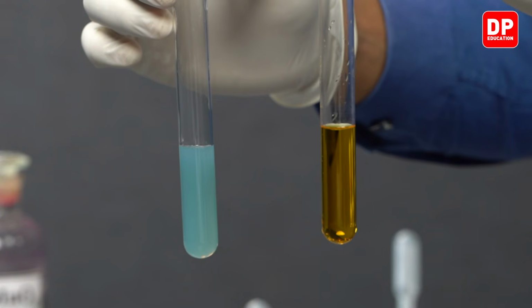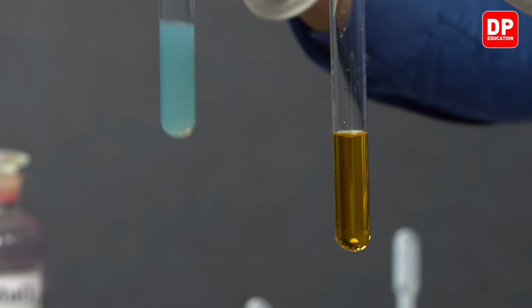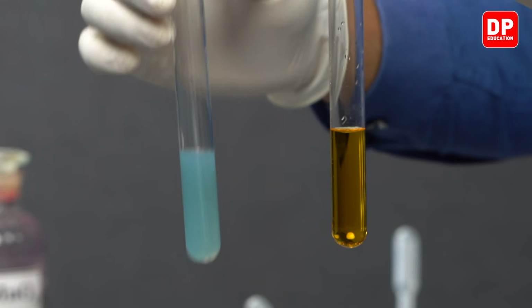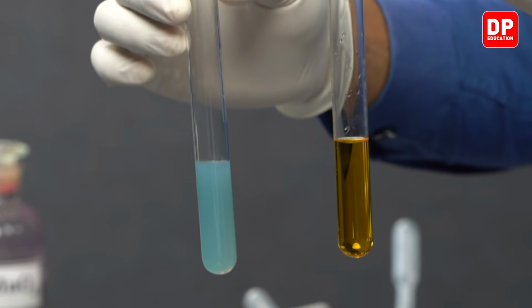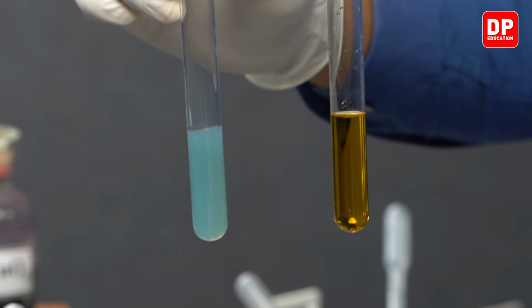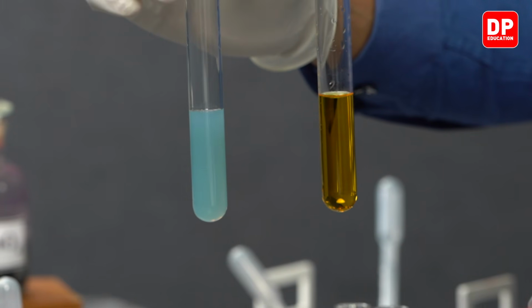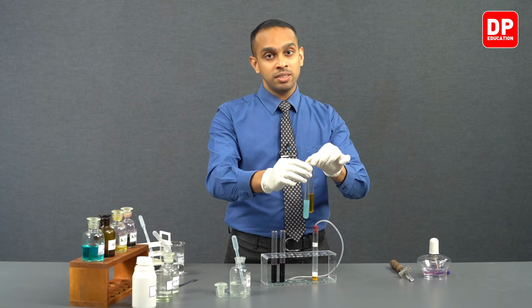So you can see the orange color dichromate ion solution turned into a green color solution, but this green color solution is mixed with sulfur. That's why we have this unclear green color solution. So the cloudiness in the green color solution is due to the presence of colloidal sulfur.